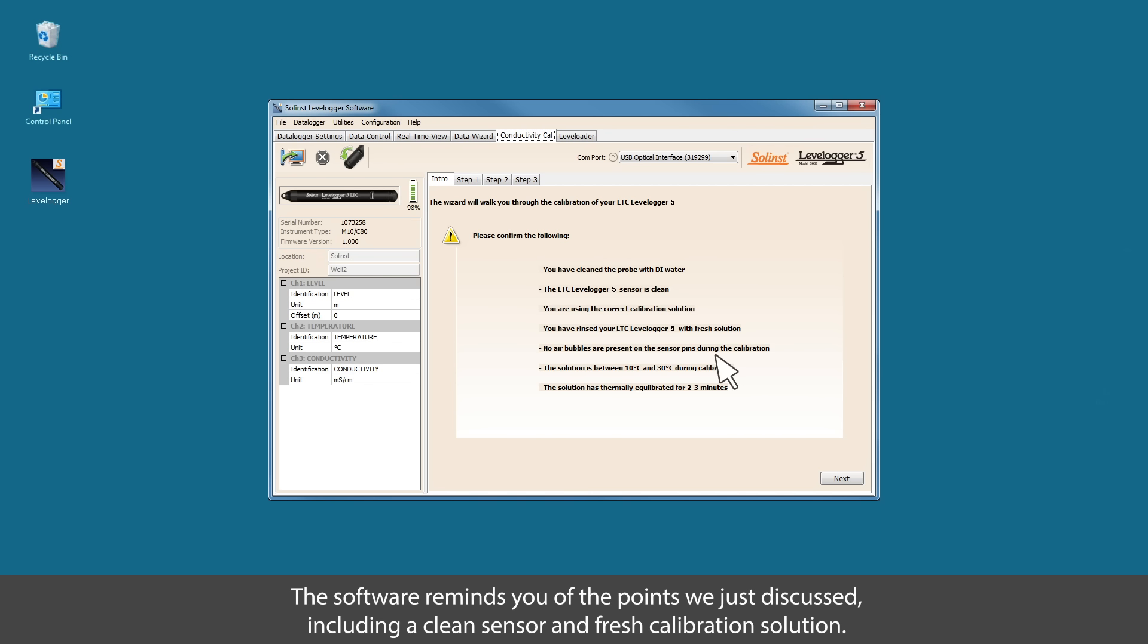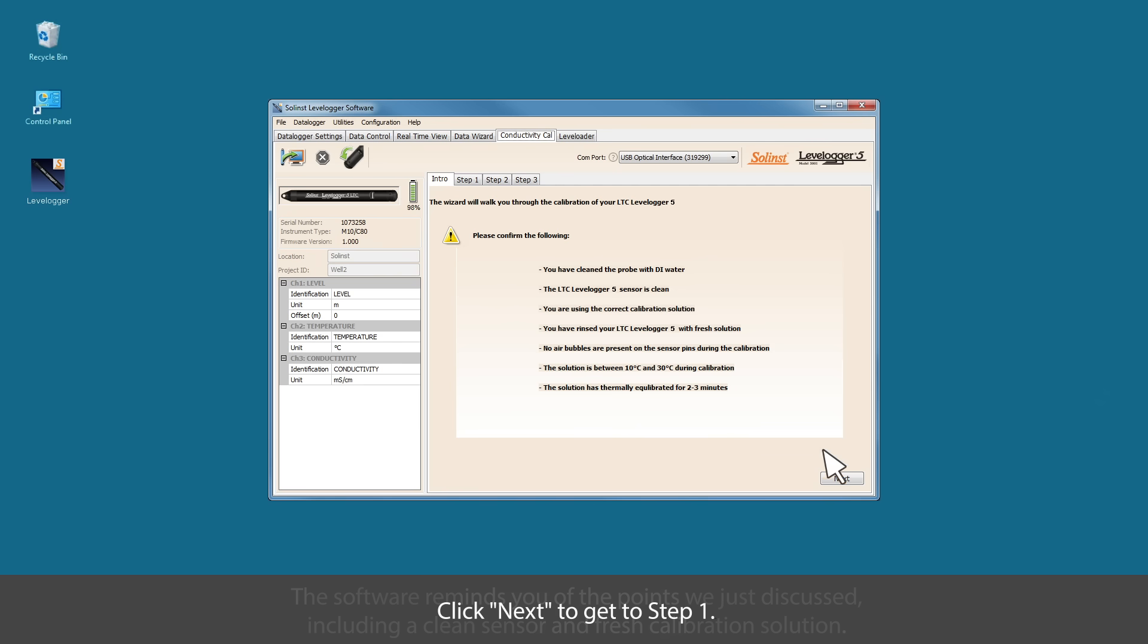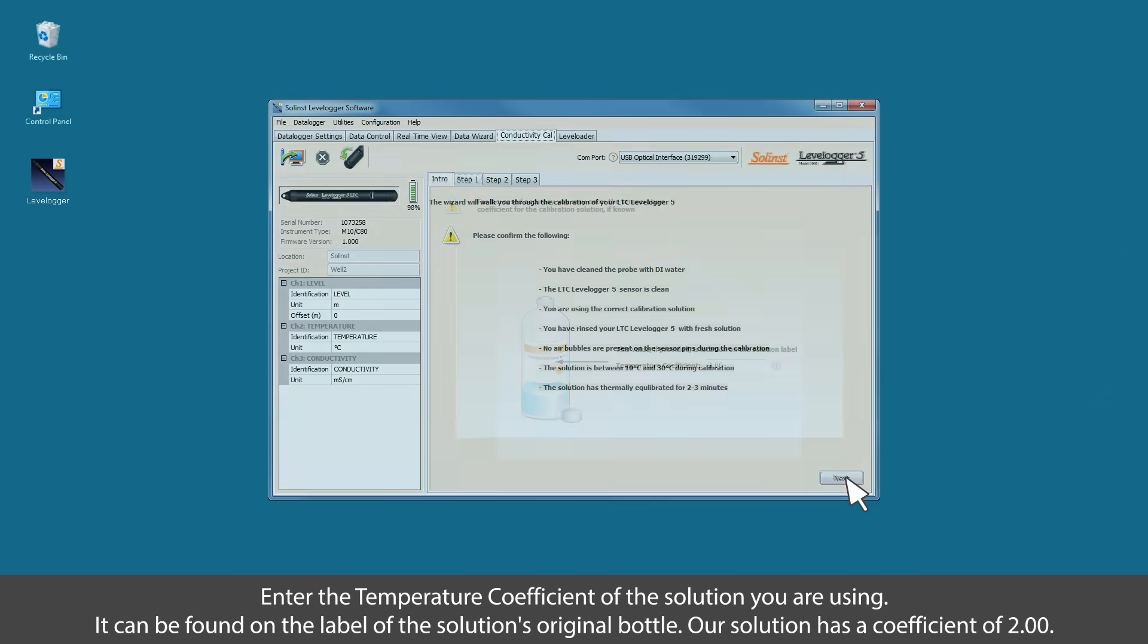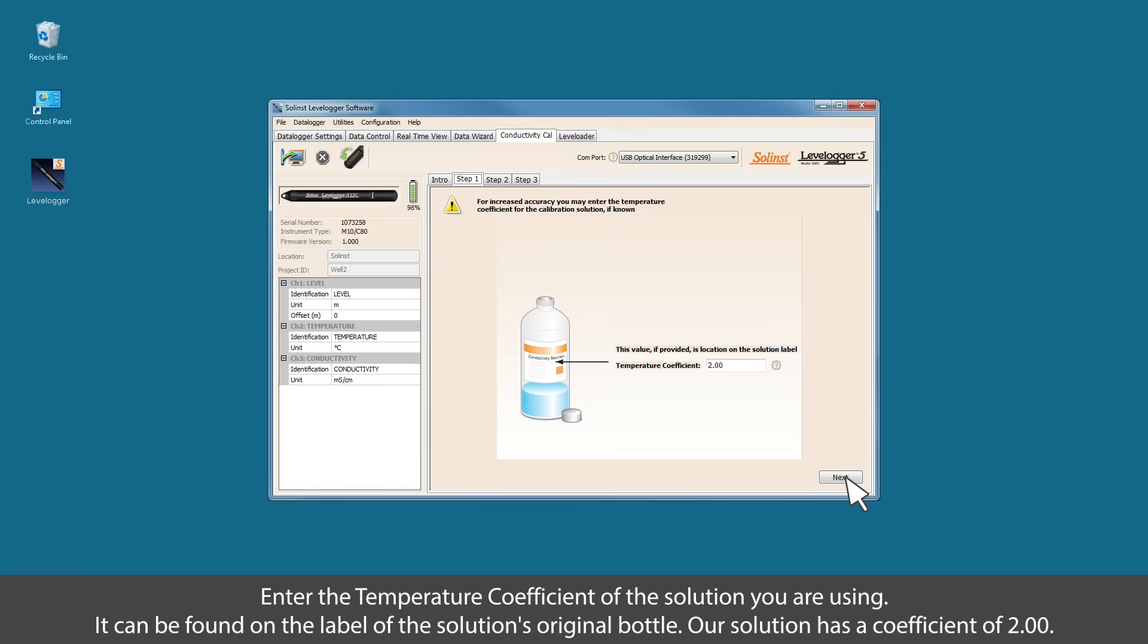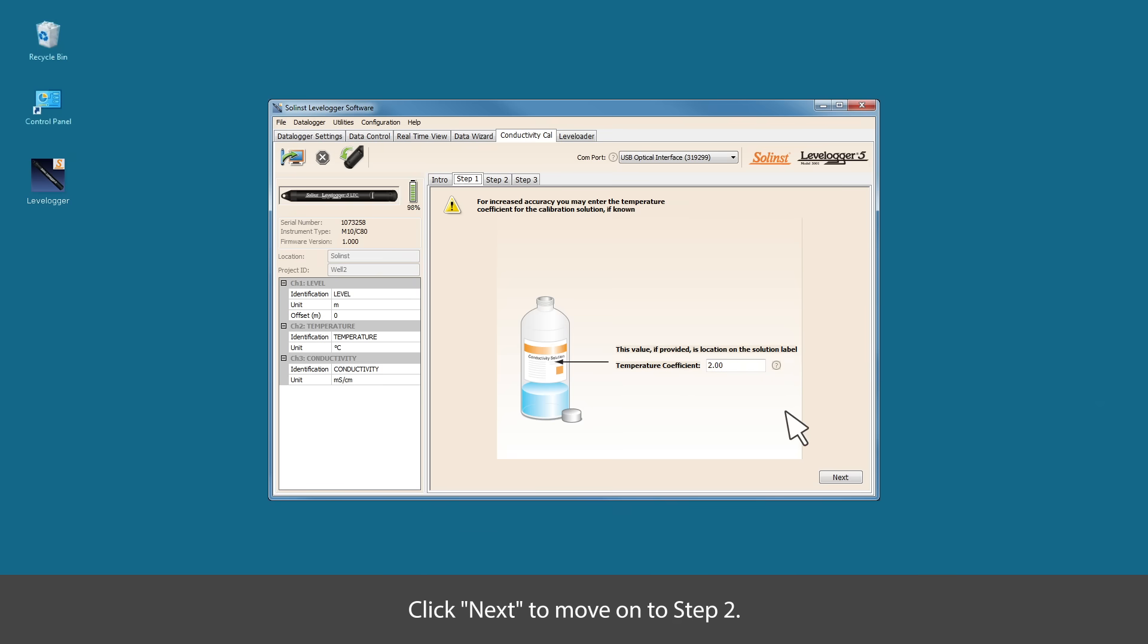The software reminds you of the points we've discussed including cleaning the sensor and ensuring that you use fresh calibration solutions. Click next to get to step one. Enter the temperature coefficient of the solution you're using. It can be found on the label of the solution's original bottle. Our solution has a coefficient of 2.00. Click next to move on to step two.